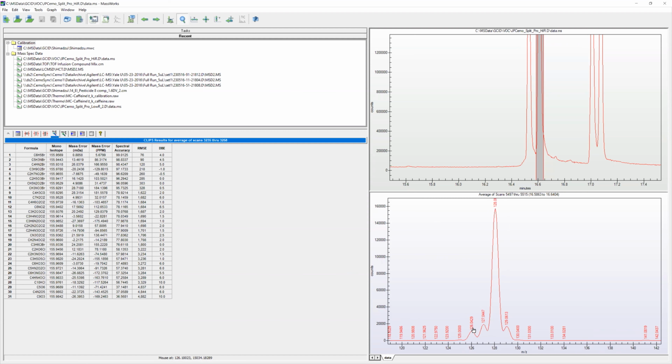So what are they? Most likely in EI fragmentation, what happens is not only do you get a given ion, but a lot of times you'll also strip off an additional proton. So you'll get M minus H, or in this case, even M minus 2H. The problem is those lines are overlapping with the molecular ion.